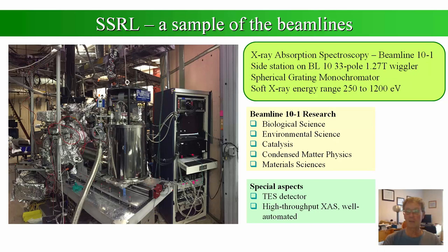So this beamline actually emerges on the SSRL side of the fan, and there's a mirror that deflects it, I think, underneath, or maybe above, I can't remember. But it crosses over, and then it comes out on the inside, on the SPEAR side of the beamline 10. So this is beamline 10-2 over here, this hutch wall here. And this is a radiation-proof enclosure to keep users and photons apart.